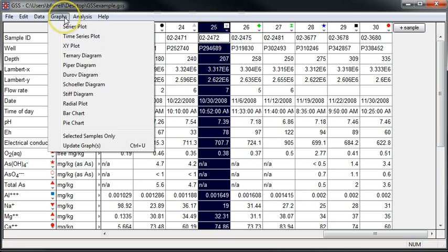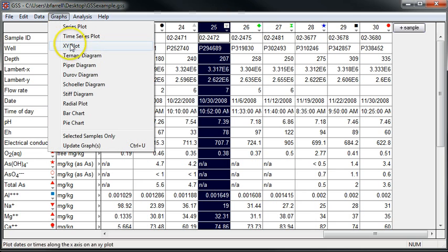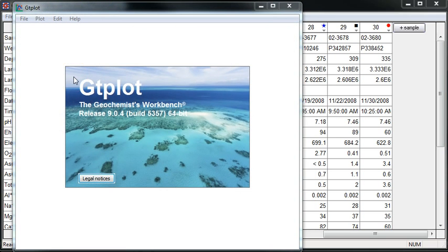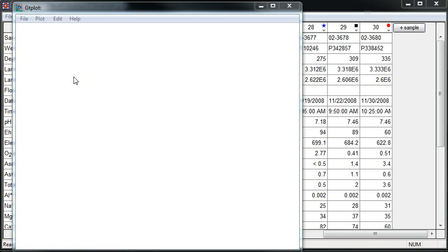Now I'll move to GSS at the top and select Piper Diagram. This will launch GTPlot.